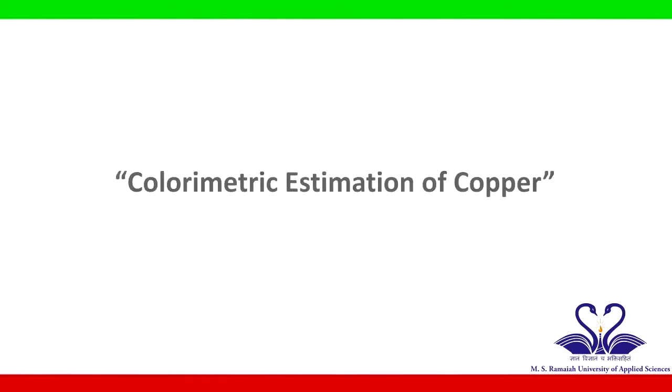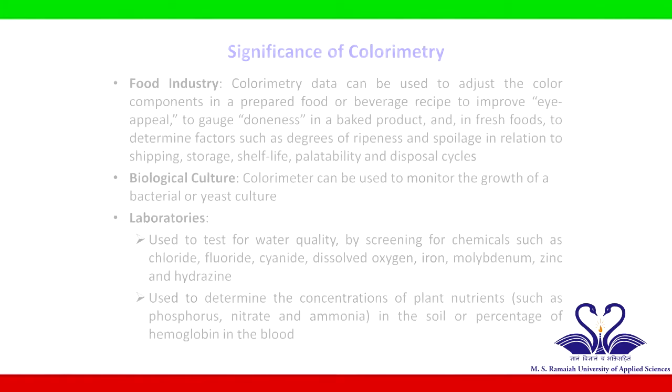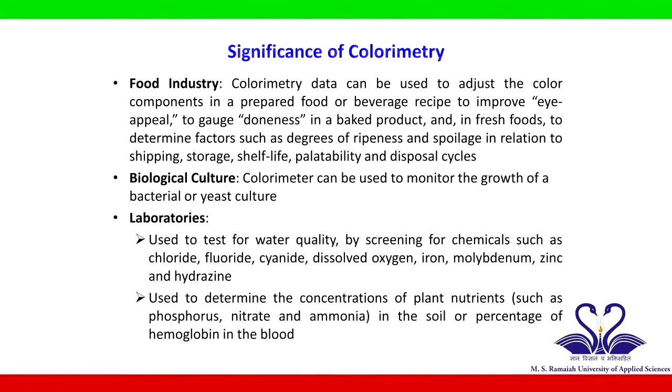Hi viewers, let us discuss colorimetric estimation of copper. Before performing the experiments, let me tell you the applications of colorimetric estimations.